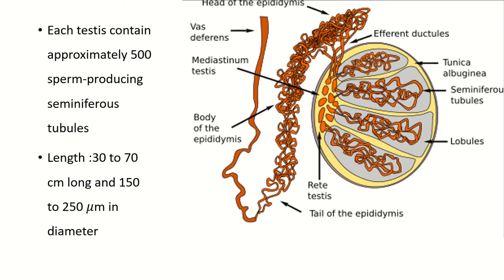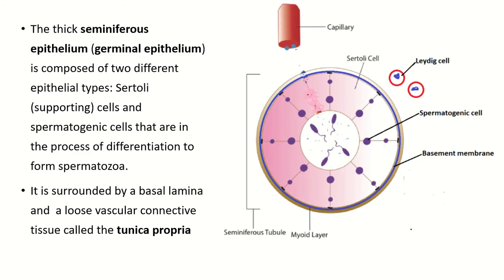This is the sagittal section of the testes. The outer layer is known as the tunica albuginea. These are the septa, which divide the testes into different testicular lobules. Each testicular lobule contains one to four seminiferous tubules. When we look at the testes in histological section, we see several circular areas, and each circular area is a single seminiferous tubule.